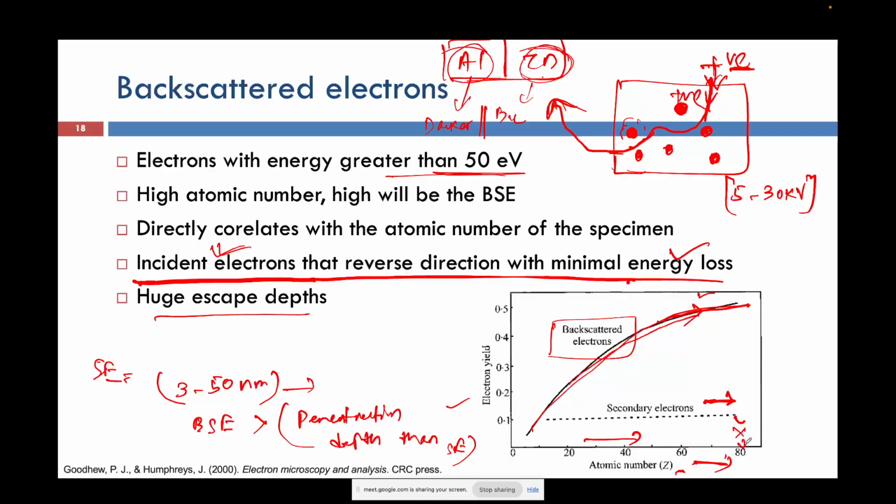I request that if you can give some comparison study, it will be helpful. Regarding the count, many cases will tell you the count. I will tell you how the counts are actually obtained. In the next class, I will bring that photo and we'll see how the intensity varies, because intensity is nothing but counts per second. So based on the detector, you will get the count. I will try to get that image and explain it to you. Please, thank you.